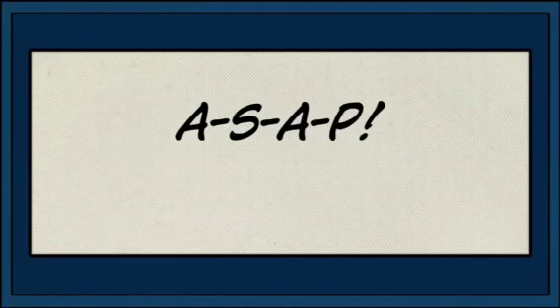Now you have learned all the components that go into making a blood smear slide — A-S-A-P: angle, speed, amount of blood, and pressure.